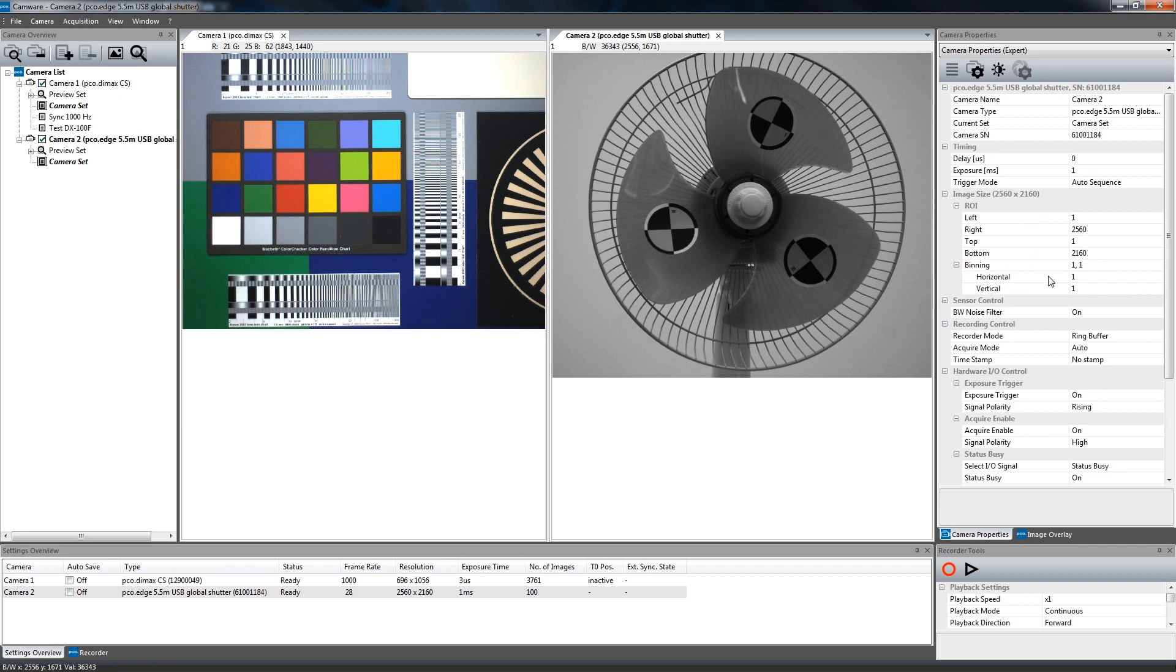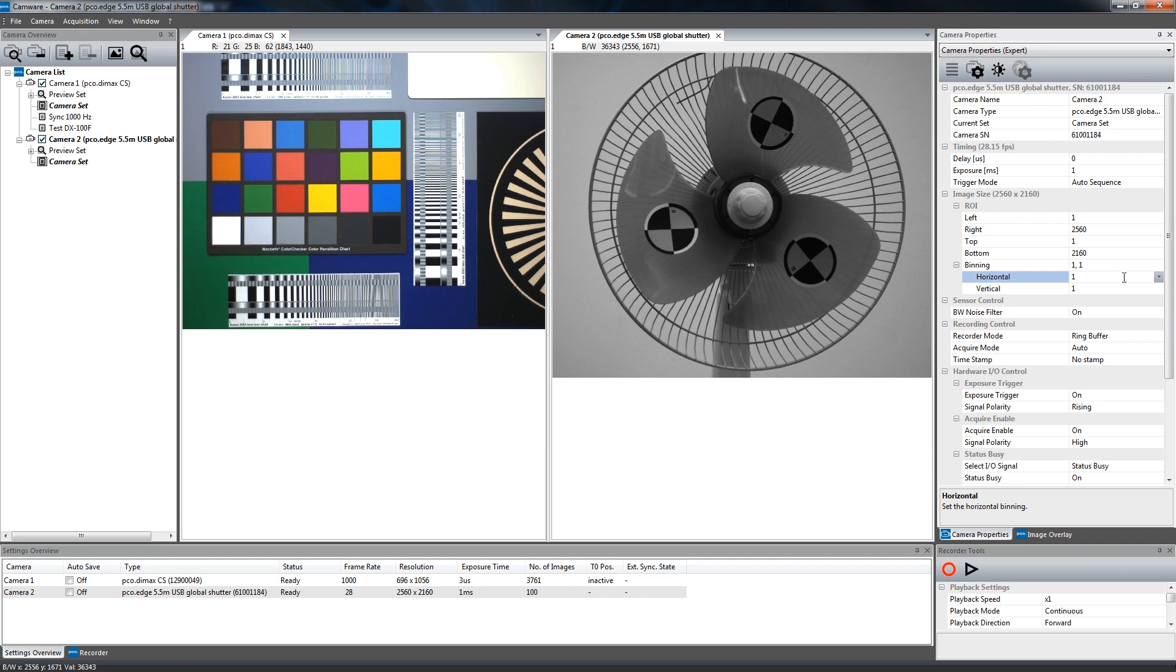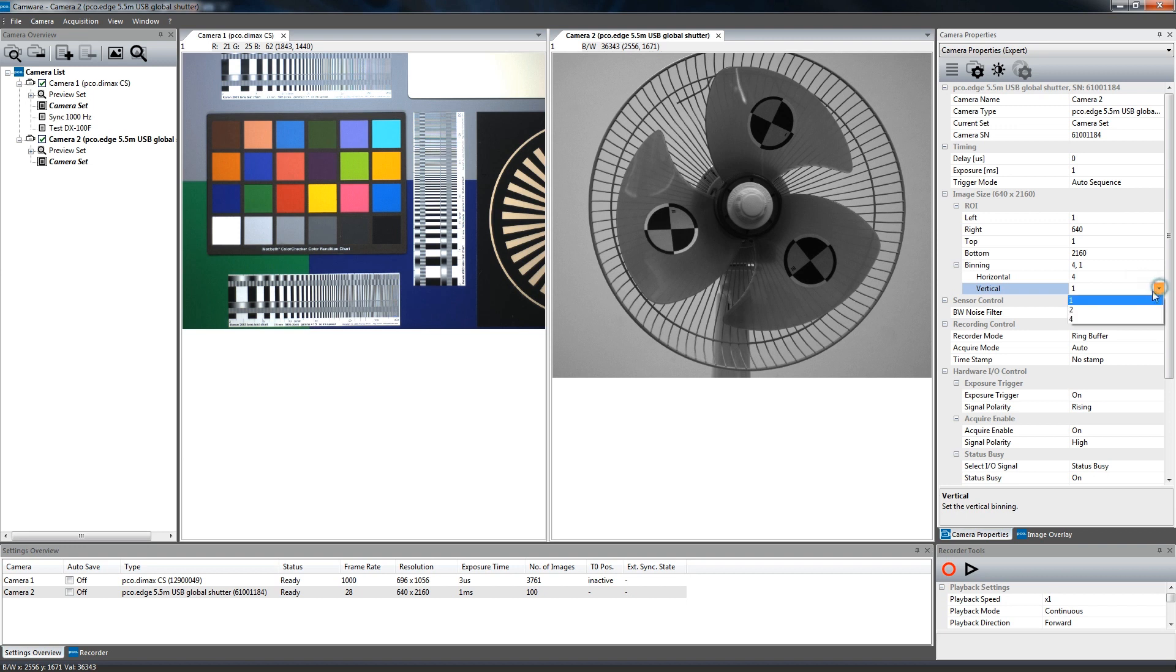Binning combines adjacent pixels in either the horizontal or vertical direction to form super pixels. It increases the signal-to-noise ratio and decreases the spatial resolution of the whole recorded image. Select a binning mode from 1x1 to 4x4.